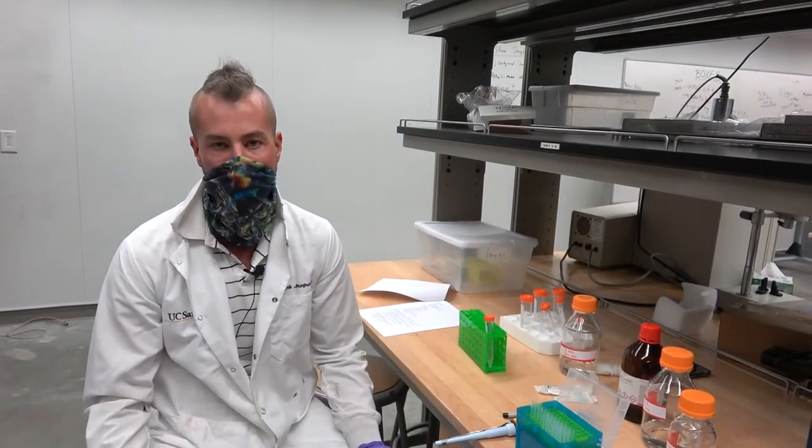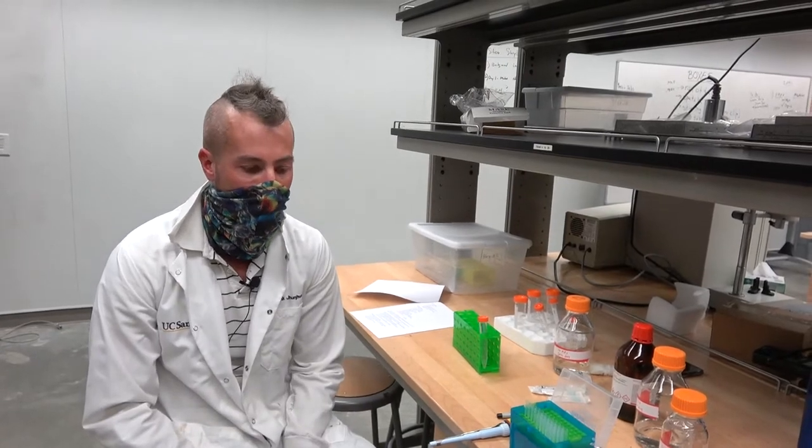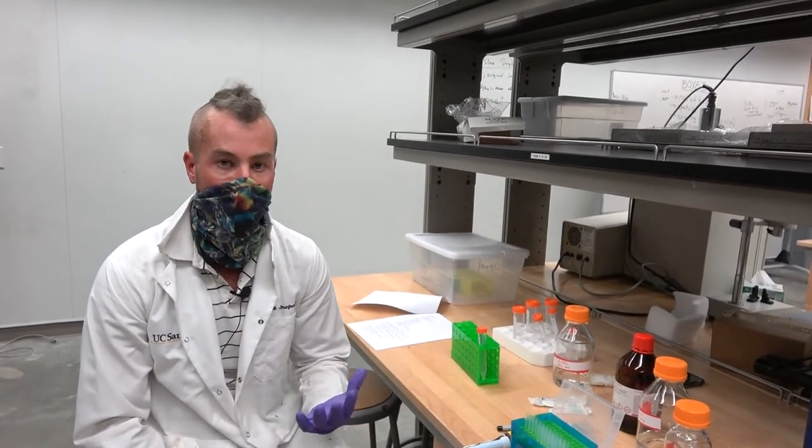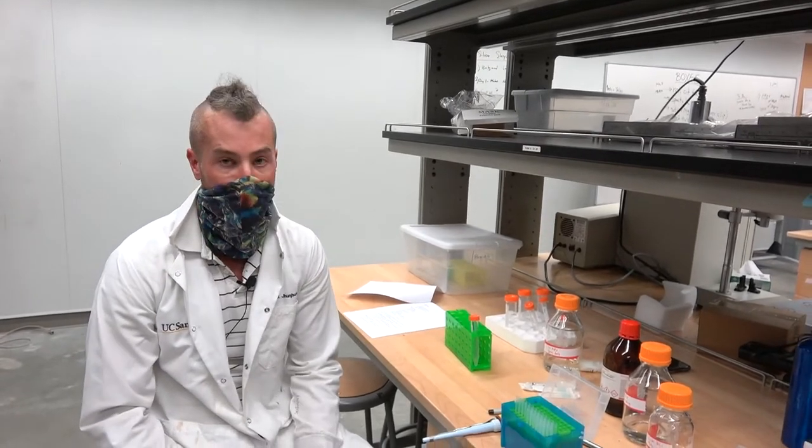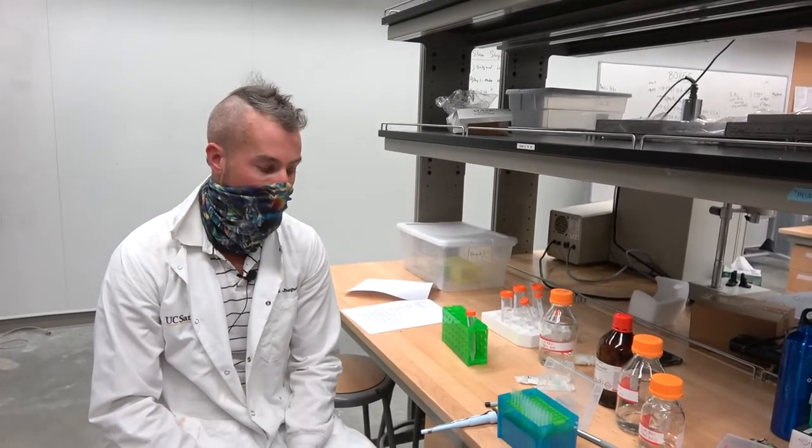Okay, so welcome to day one. If you were in lab, today would be the day that you are making the particles. You've already seen some of the background theory and big-picture goals, so maybe we can talk about some of the equipment that you would have been using.